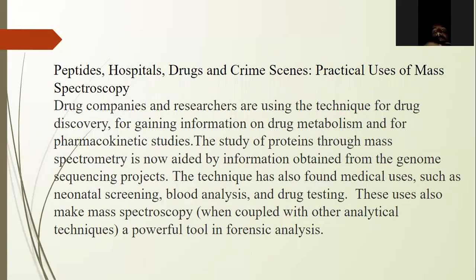Practical uses of mass spectroscopy include protein analysis, peptides, drugs, and crime science. Drug companies and researchers are using the technique for drug discovery, for gaining information on drug metabolism, and for pharmacokinetic studies. The study of proteins through mass spectrometry is aided by information from genome sequence projects. It has also found medical uses such as neonatal screening, blood analysis, and drug testing, making it a powerful tool when coupled with other analytical techniques.